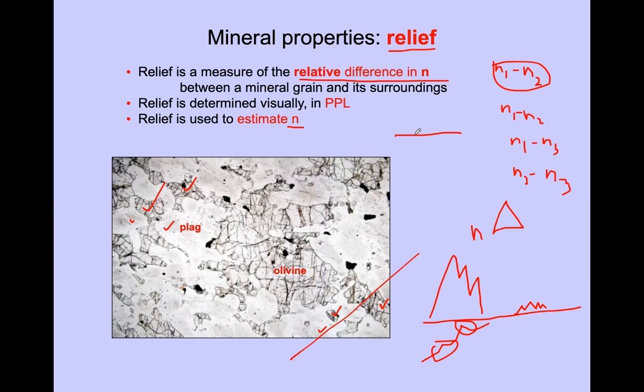It's exactly a matter of the glue used here. We are using a glue on top of this glass slide, right? And on top of that you have this rock piece.